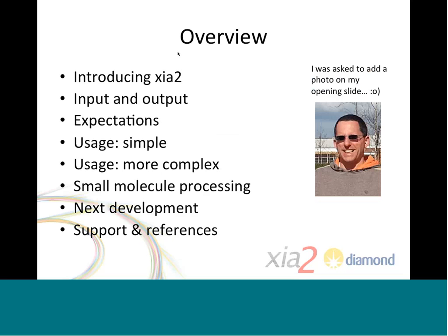So I'll crack on. So I was asked to put a picture of myself on the introductory slide as well. Okay, so I thought I would start by introducing what XIA2 is, give you an idea of what it is if you're new to using the software, the kind of inputs and outputs you can use with it, some expectations you should have as a user. Then I was going to talk a bit about simple and more complex usage of the software package. Then I'm going to finish off with talking a bit about small molecule data processing, where the development of XIA2 is going, and finally some discussion on the sort of support of the software and references and so forth.